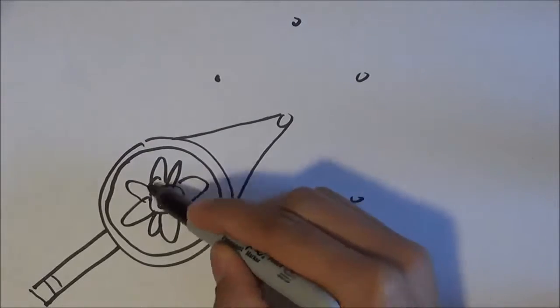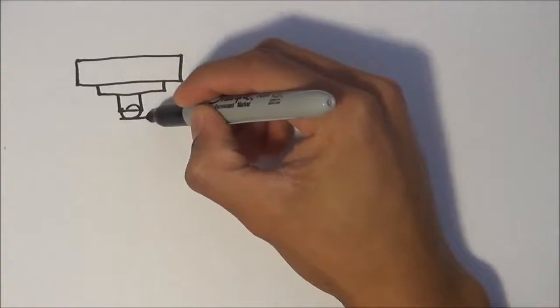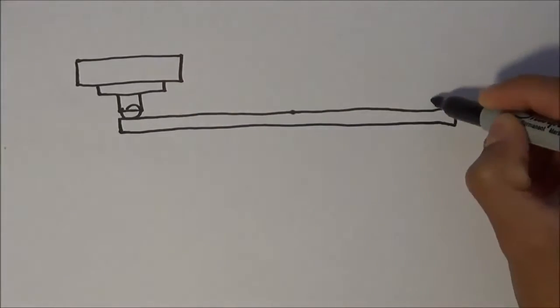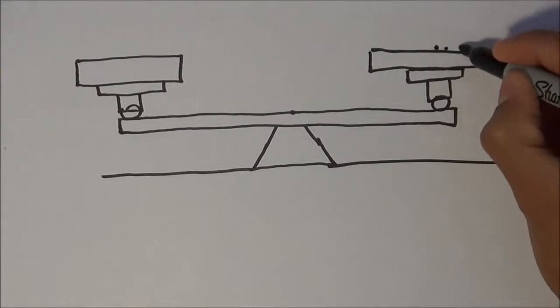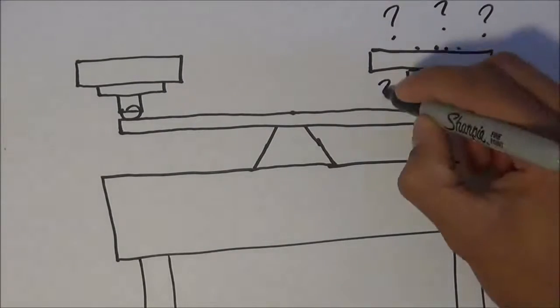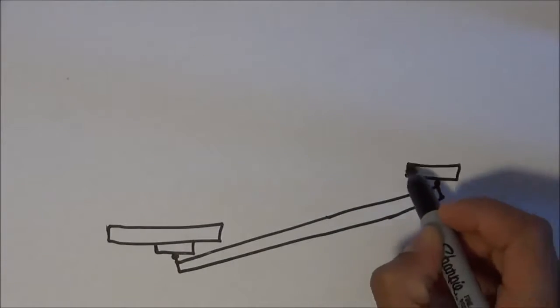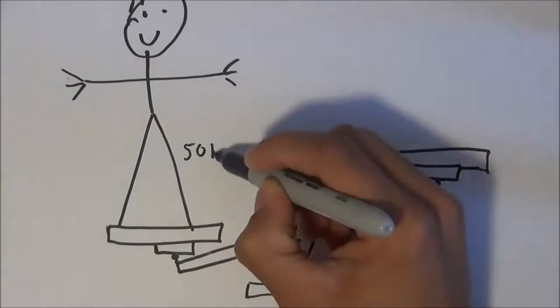Well, let's try using a scale. We can measure objects with great precision using very accurate scales. But what happens when we can't make scales any smaller? Our measurements will become less accurate the smaller the object. Take carbon for example. Lots of things are made out of carbon, like you and me. We can be measured. However, individual carbon atoms are too small, they can't be seen, let alone accurately measured.